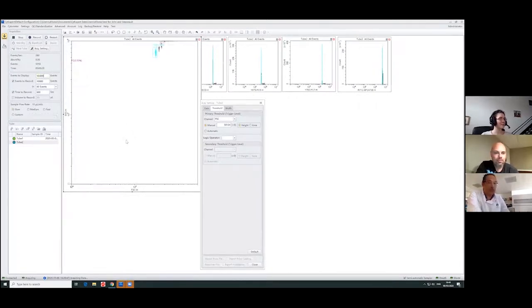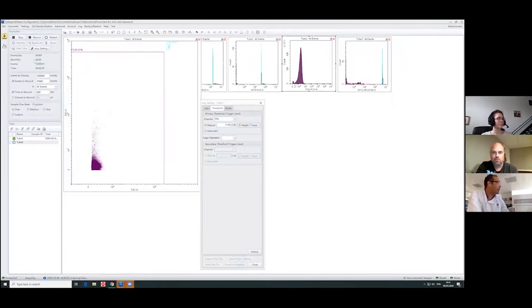You can see here some events that you haven't seen before. Okay? I can go down even farther. I'll go down to here, and you'll see quite a lot of events coming up down here. And I can keep going down. And you'll start to see all that noise. Okay. The other thing, can you point out for us, Alfonso, how the abort rate has just skyrocketed? Yeah, there are two things I'll show you. One is this, and the abort rate is 42%. Okay. Now if I increase the threshold again, all that noise is gone.